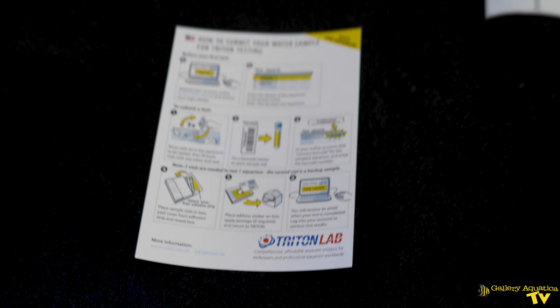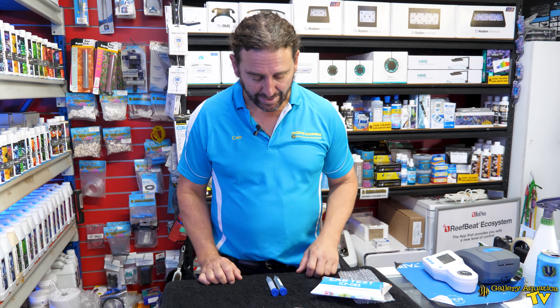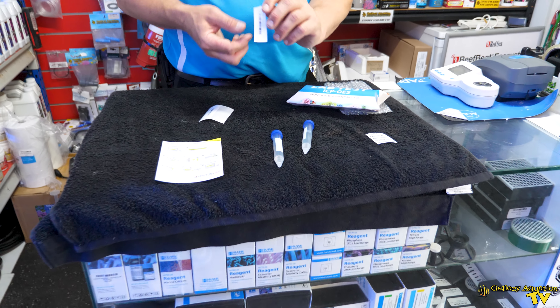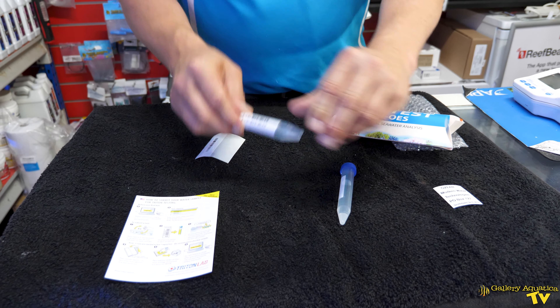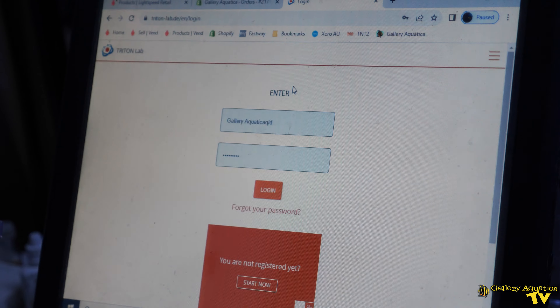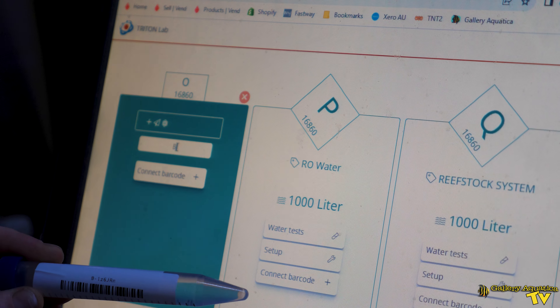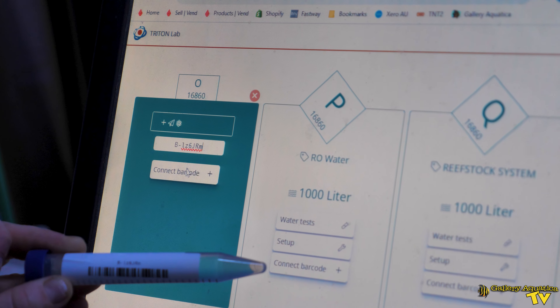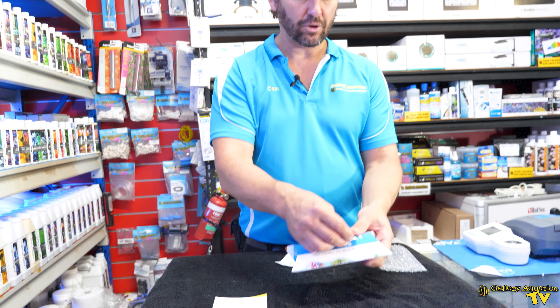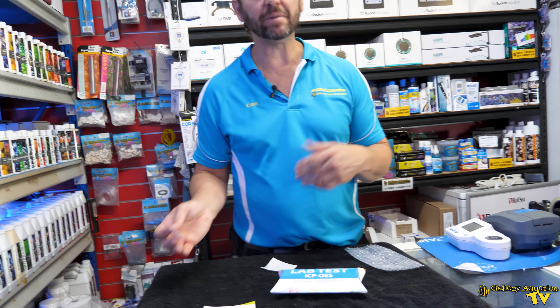You start by registering your account with Triton, and from there you're able to fill out the details of your aquarium — the size being the most important part. Then you take your samples, attach the barcodes — one, two — and register these barcodes on your Triton account. You put these back in the packaging, and you can either send it off with some stamps, or we generally put it in a satchel to be sent off.